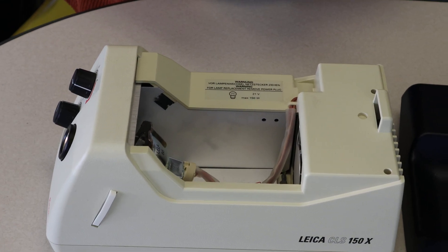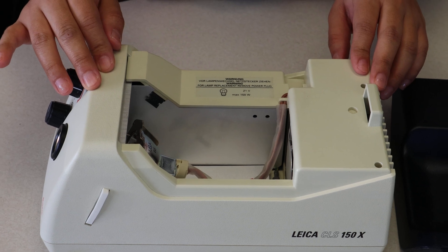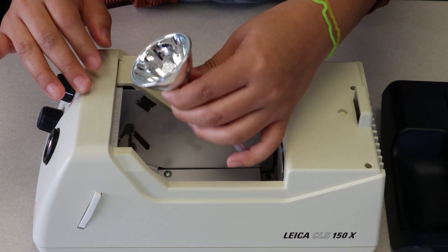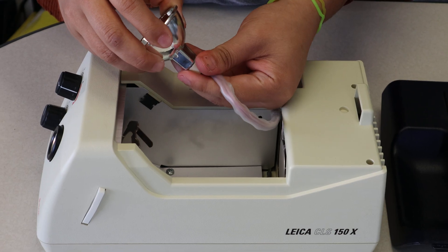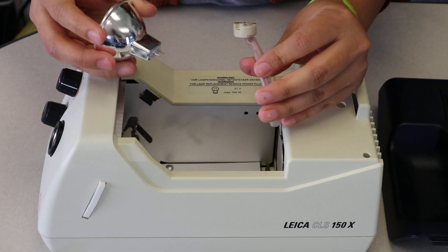If you look down in there, you'll see there is the bulb and a little socket with wire attached. You can go ahead and pull the bulb out, and then you just unplug it from the socket attached to it. Now, make sure it's been off for a while if you're just changing the bulb, because sometimes they can get very hot.